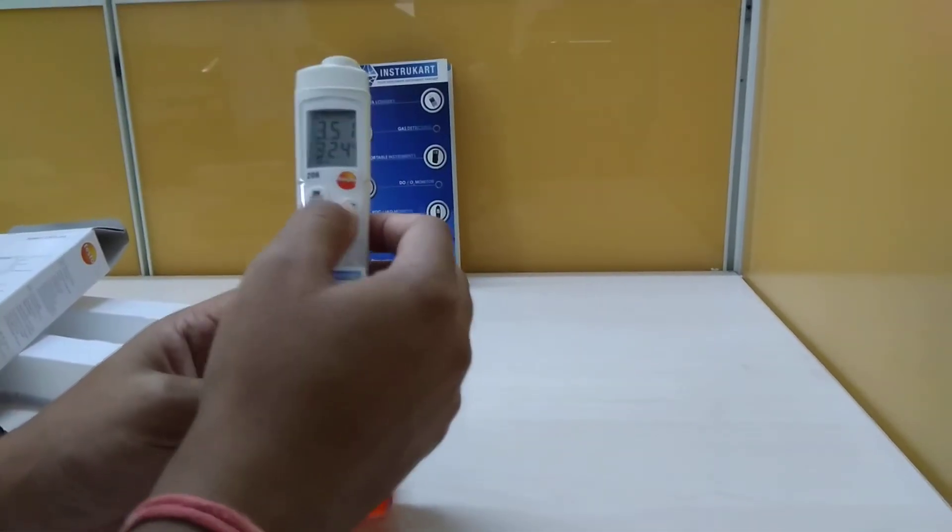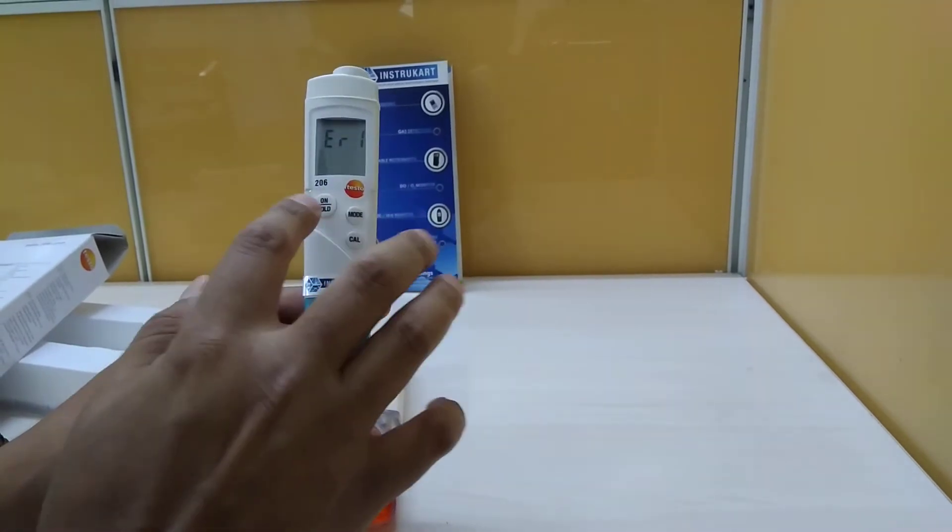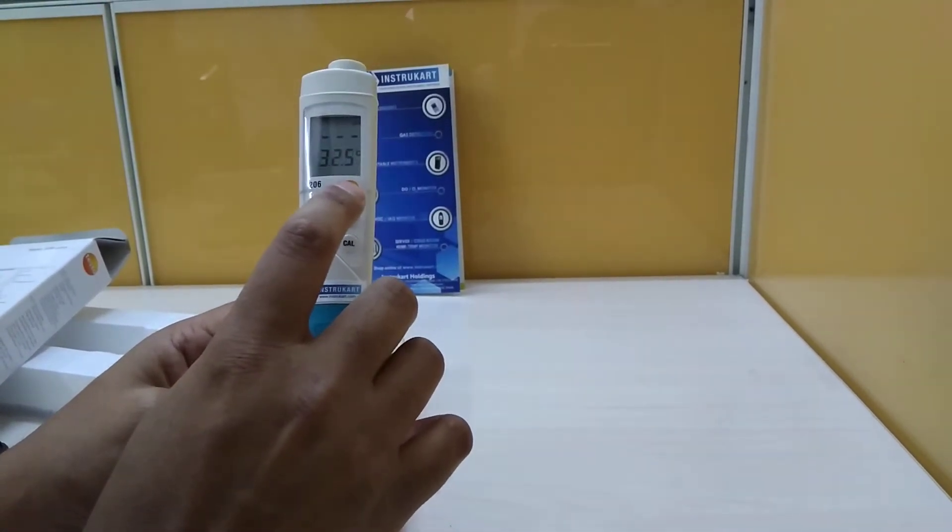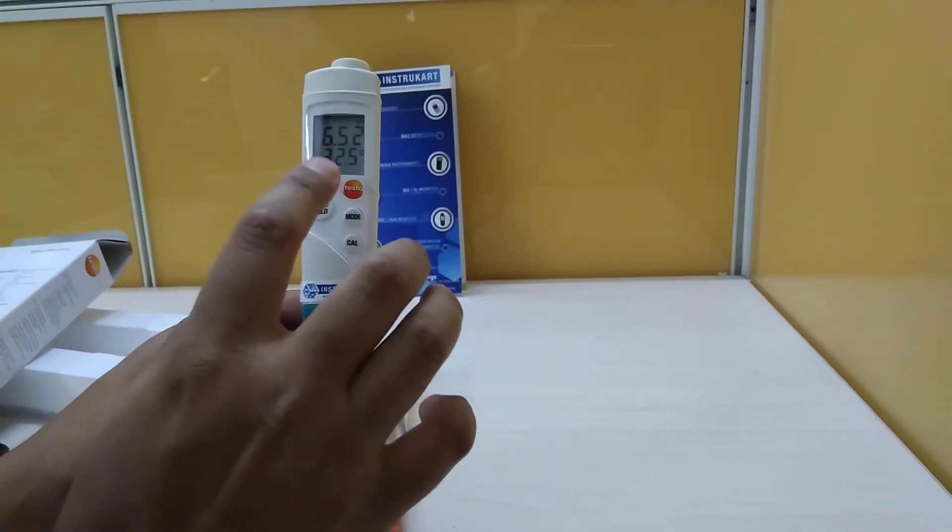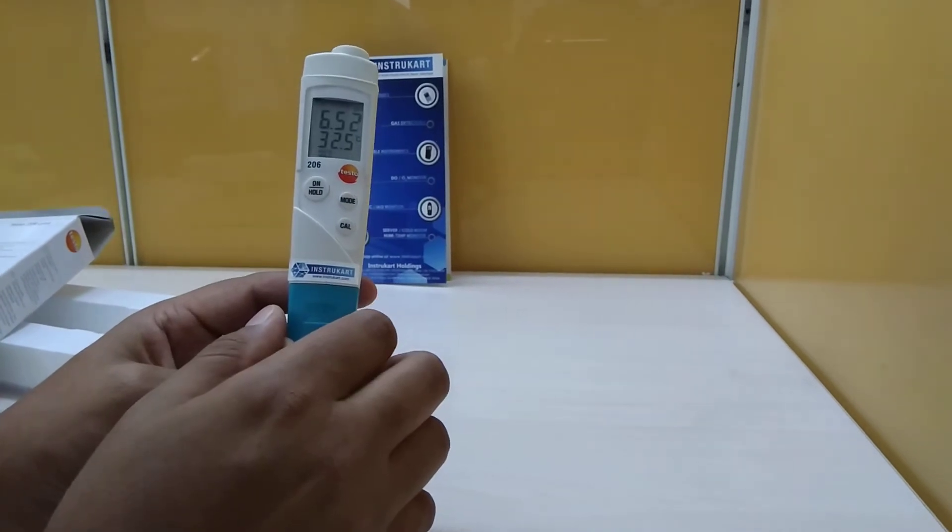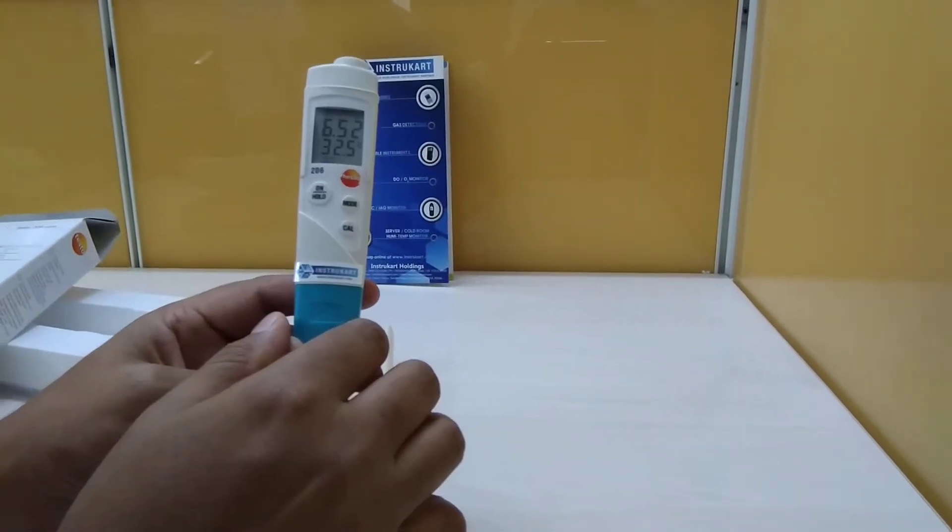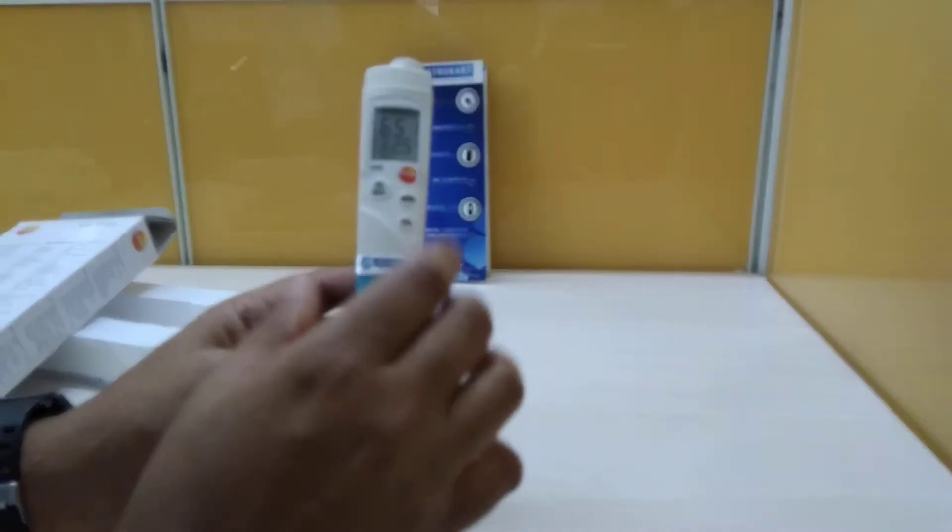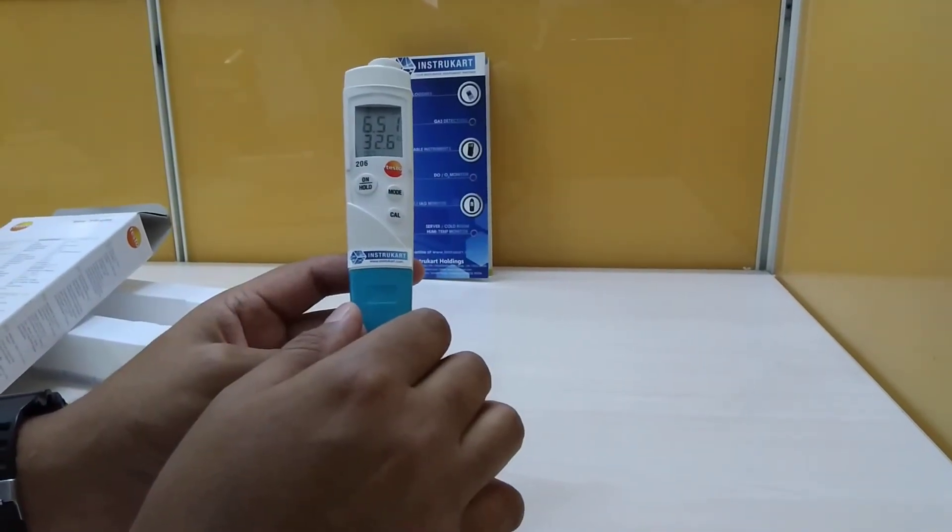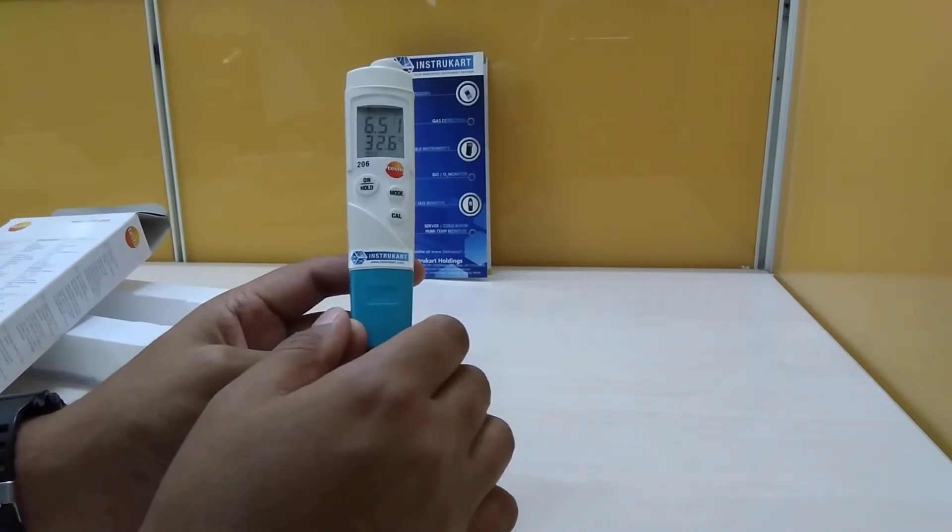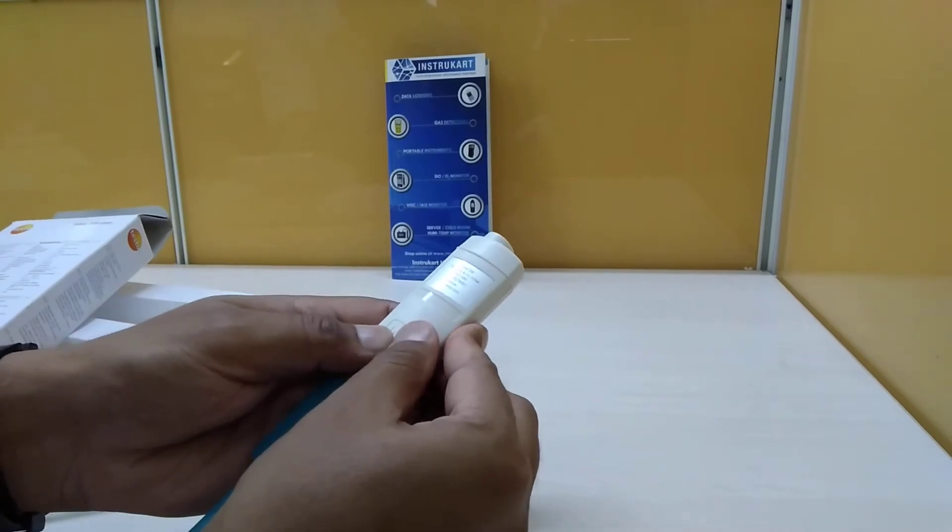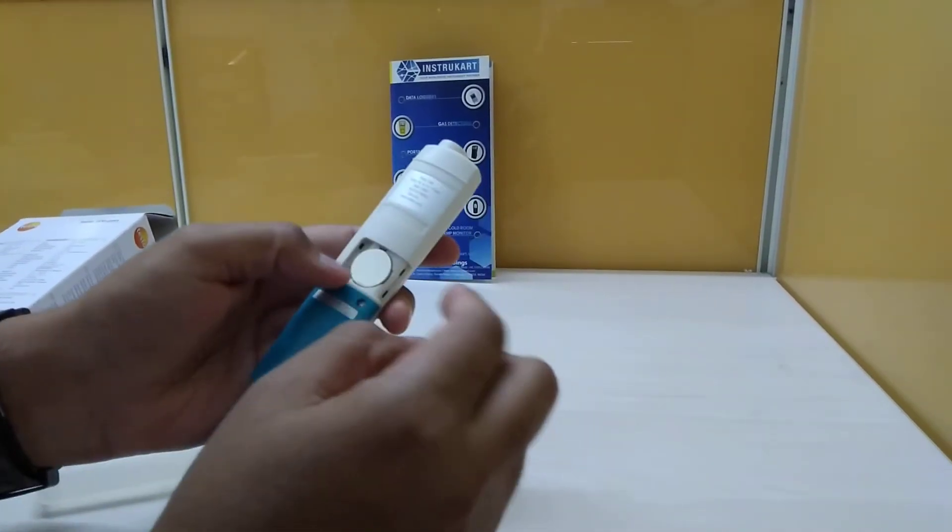We have three buttons on the top which give you the current pH and current temperature. It takes a measurement in two seconds. The application temperature for this is 0 to 60 degrees Celsius, and storage is minus 22 to plus 70 degrees. It has one battery, which you can see here, the CR2032 battery.